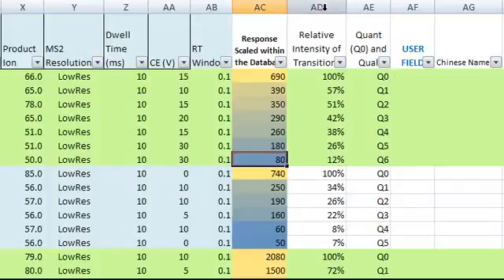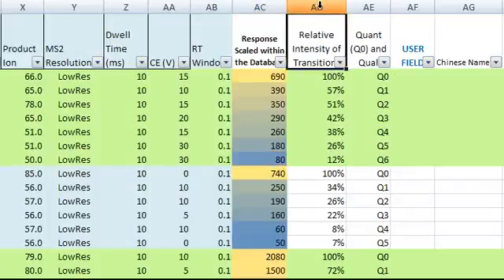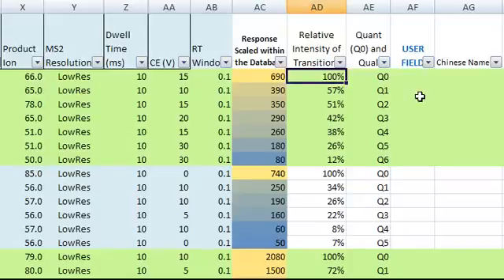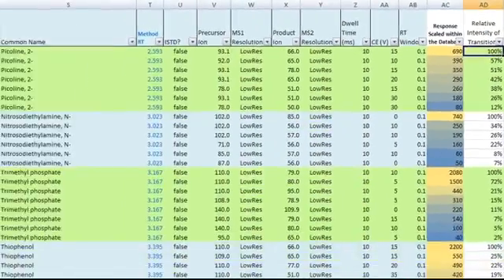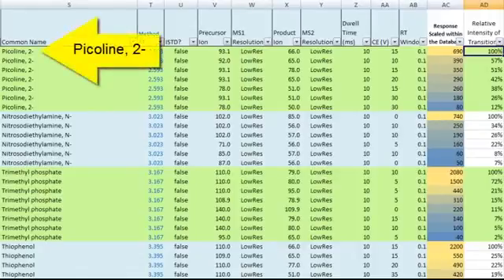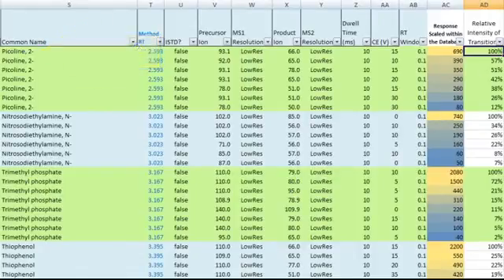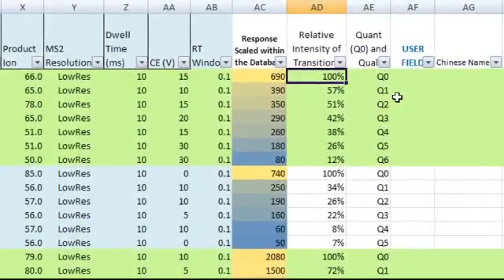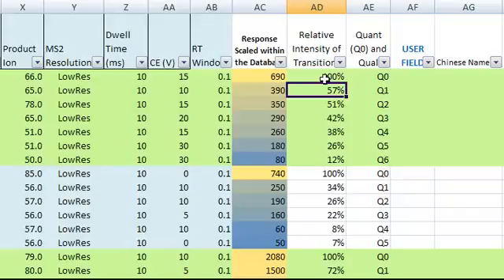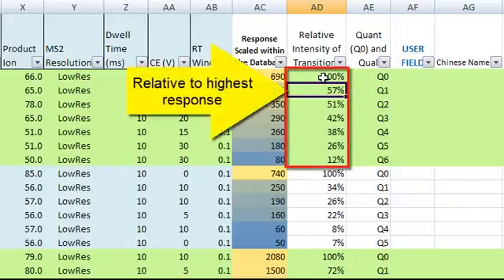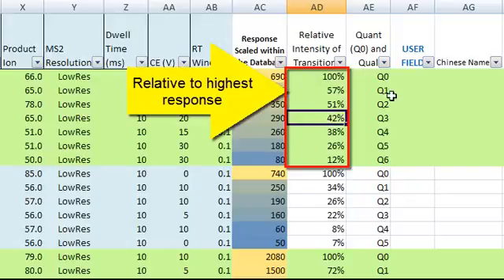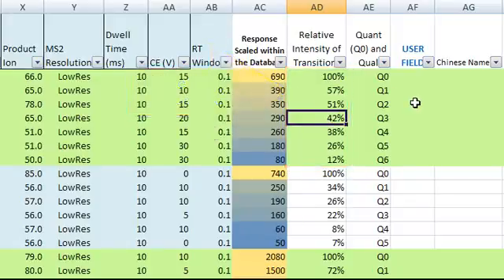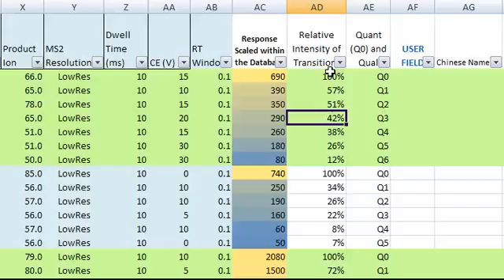The next column shows the relative intensity of each transition within a compound. The first one is 100% for picoline 2. This is the highest response among the seven transitions. Next one, 57%, is the response of this transition relative to the highest response. 51%, 42%, and so on. You can use this column to quickly find out the significance of each transition.